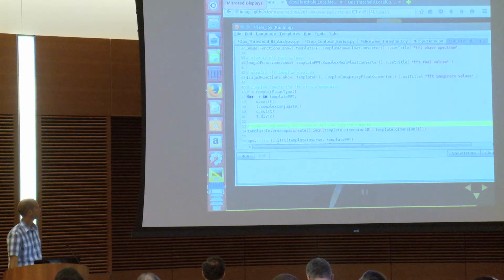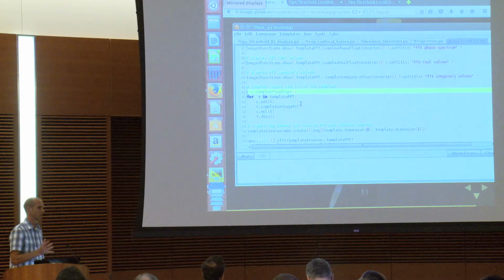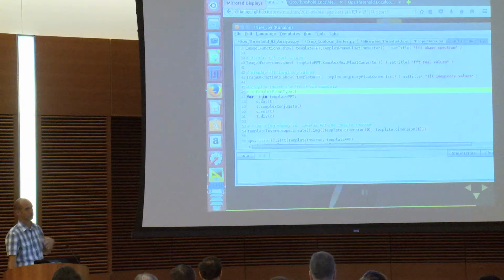If you ever look at ImageLib2 code, you'll see a lot of little loops like this. This is meant to be really generic. If I'm correct, this is how it gets its ability to deal with almost any type of number. If you ever look at the design of this, which is really great, there's a huge type hierarchy.